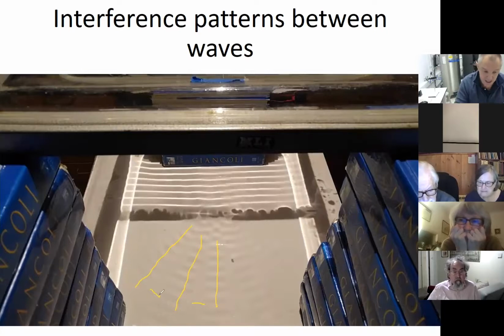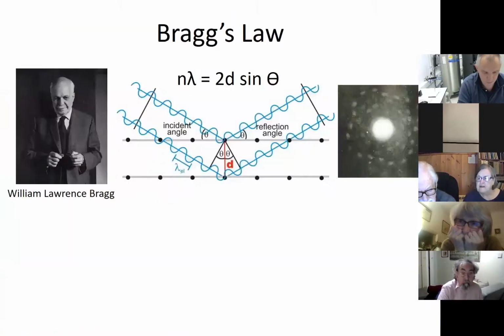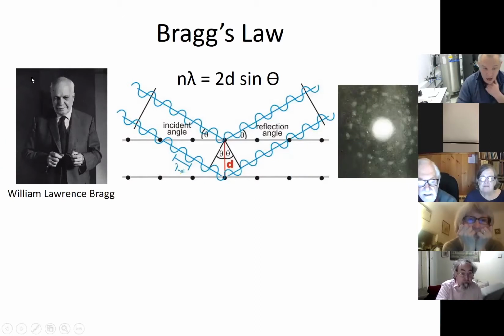And that then is the basis of diffraction and the pattern of spots that you see. Let me just try and move on. Okay, so the same principle is causing this pattern of spots here.